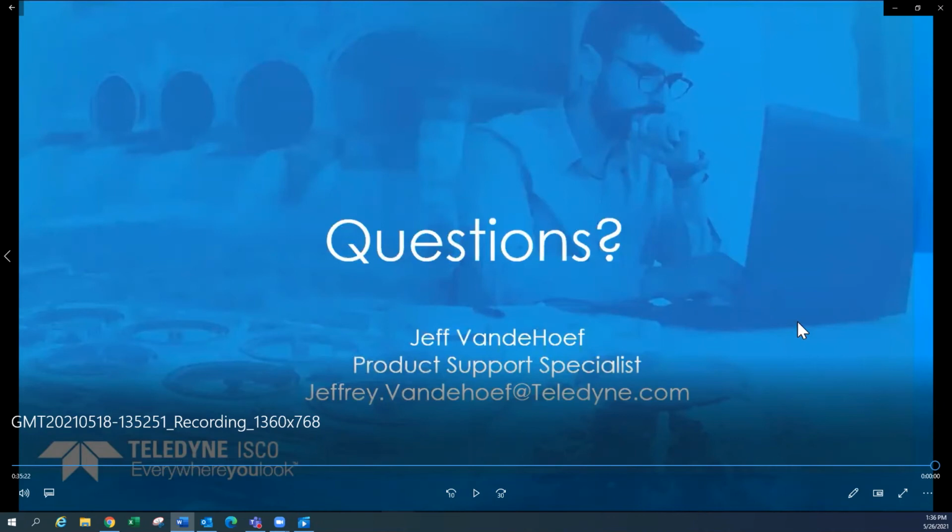Also, it will get a quicker sample for you, and you can take more samples in a shorter amount of time. So yeah, we always say try to get it as close as you can, but if you can't and you can only go a certain part, then yes, you can have it farther.